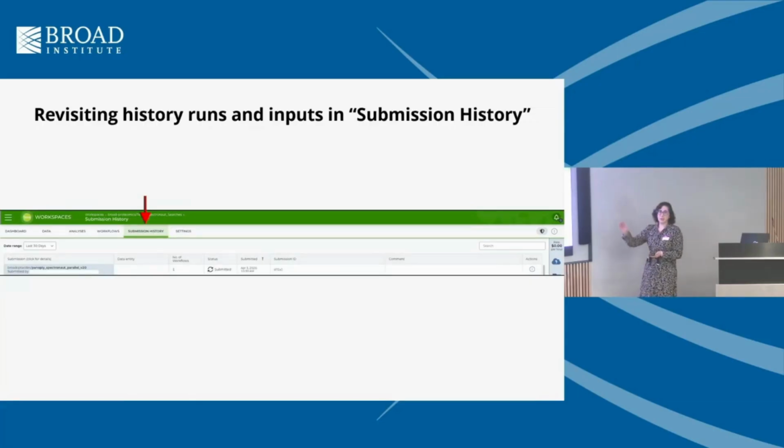All of your jobs are going to show up in a history tab. So this is great if you ever need to go back and figure out, when did I run this set of files? How much did it cost? There's a really nice way to get to that. If you click on one of these jobs, it's going to take you immediately to a job manager page where you can jump directly to whatever section of the bucket contains your output files. So this is another nice way graphically that you can manage your usage and your runs.